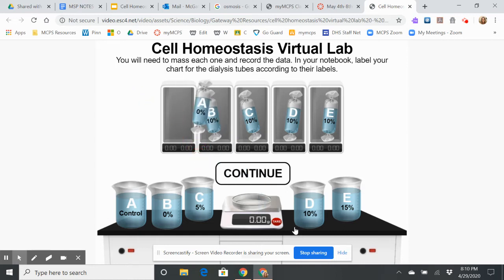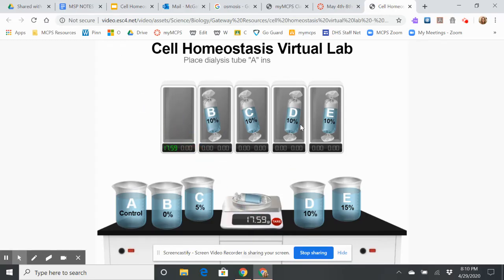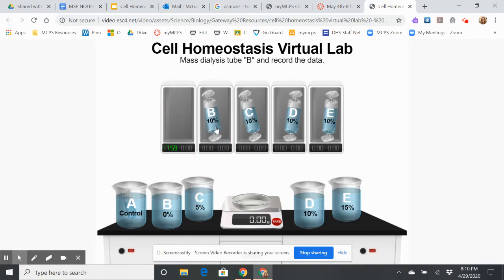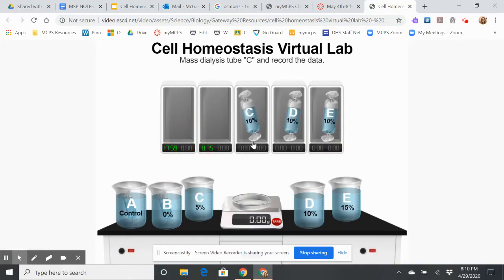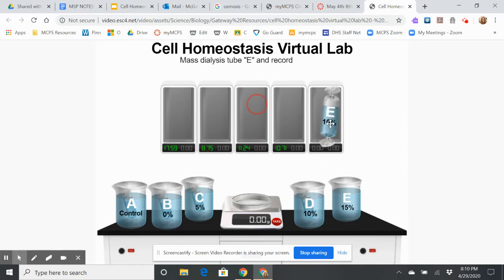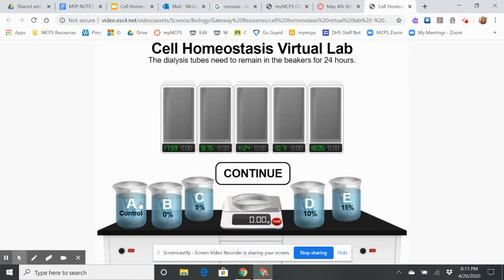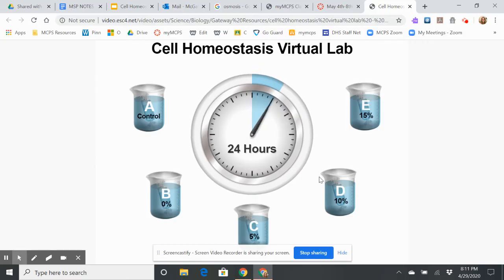I need to mass each dialysis tube first. I'm going to put each one on the scale and record its mass, then place it into the corresponding beaker. All of the dialysis tubes had 10% sugar solutions in them, except for the control, which had 0%. Now while the dialysis tube is sitting in these different beakers of water and sugar, the water is going to move in and out. The sugar is not actually going to move.